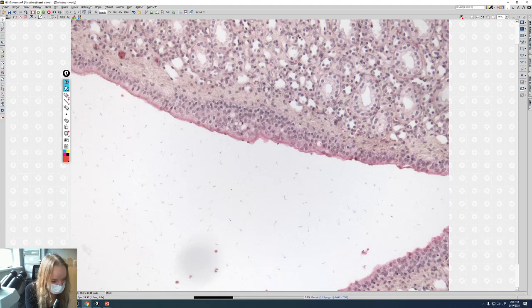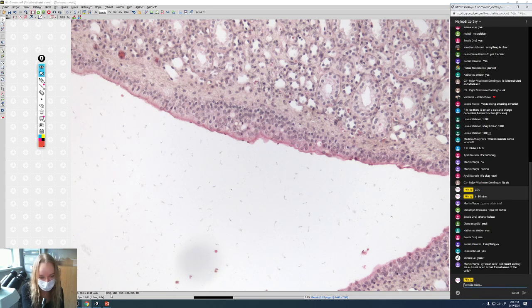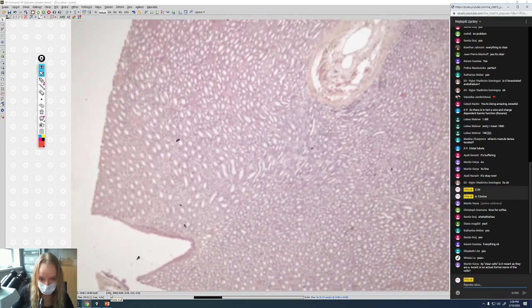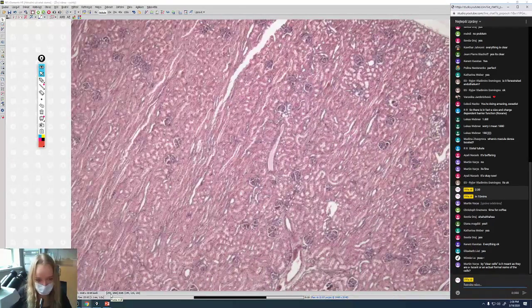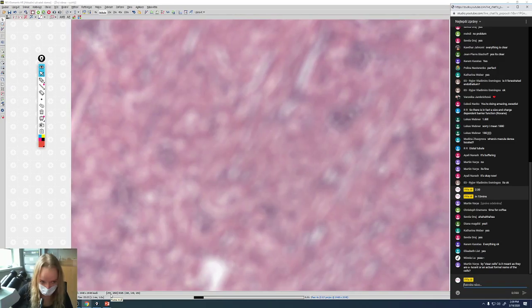So right now, as we started the discussion about macula densa, you were asking where it's located. It is an important structure of something called the juxtaglomerular apparatus, and we're going to find some good example and describe it. I'm going to write it down, don't worry, but we're going back to the cortex to find some good juxtaglomerular apparatus.